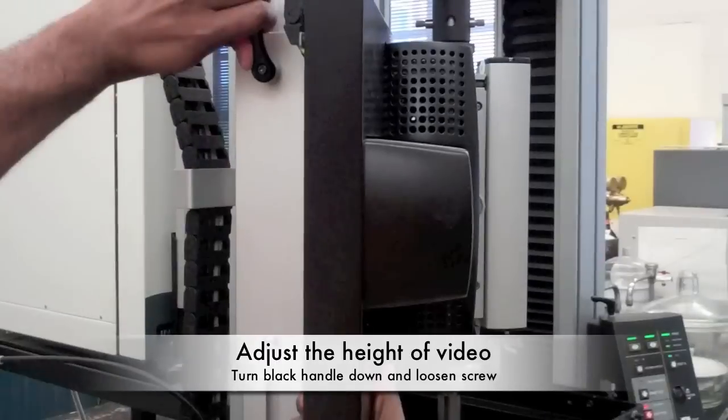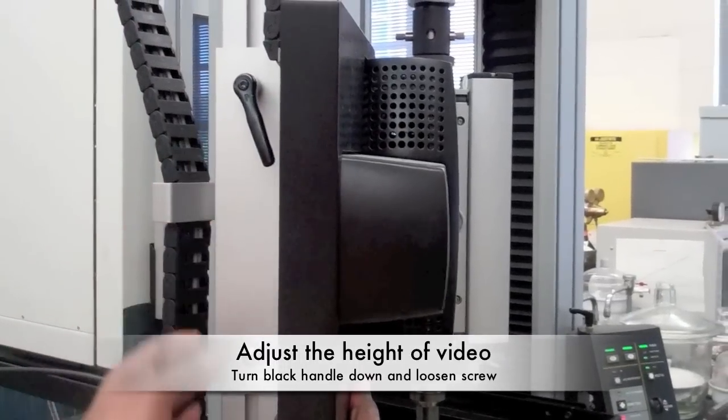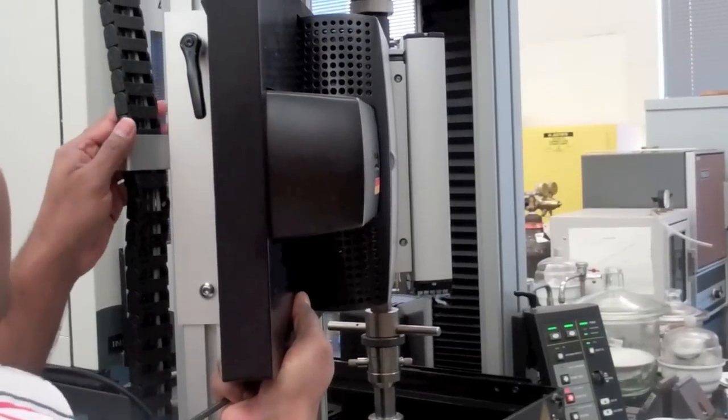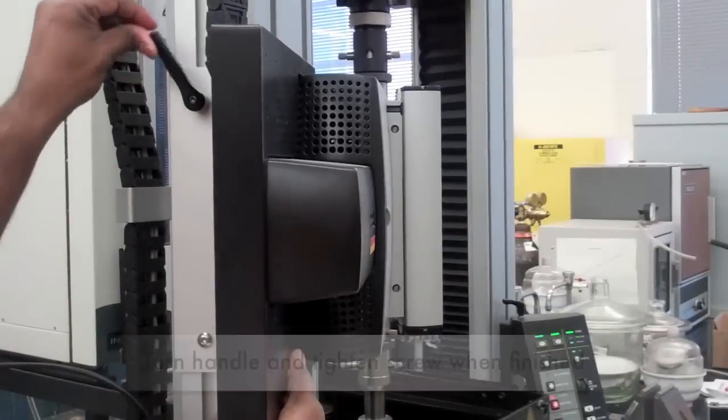If needed, adjust the height position of the video extensometer by turning the black handle and loosening the screw. After changing the position, tighten the screw and turn the black handle to the upright position.